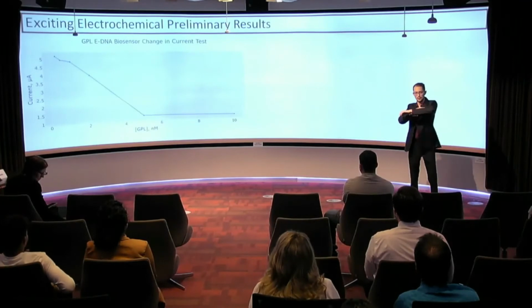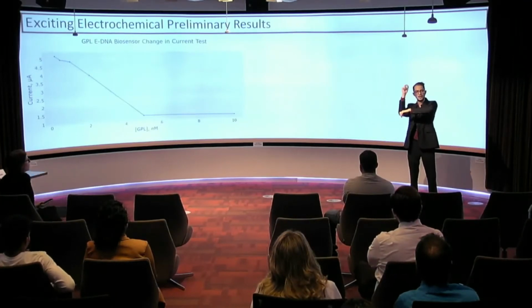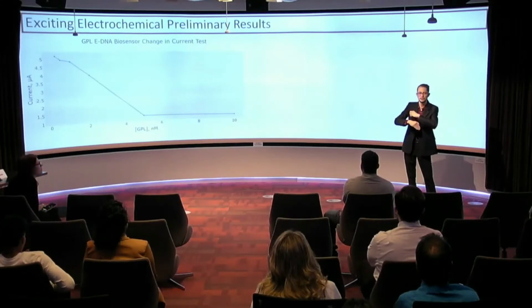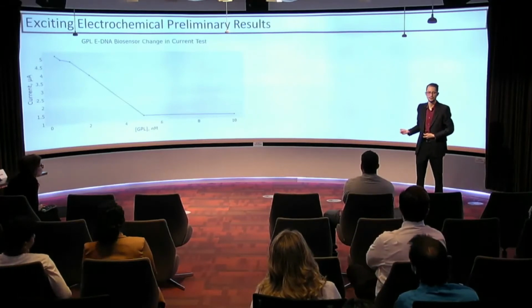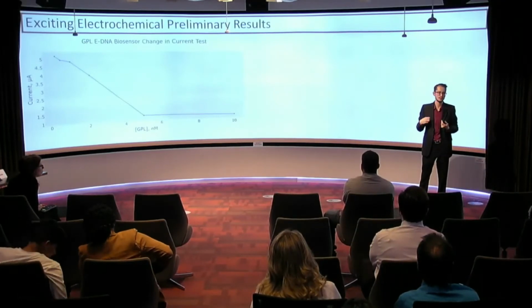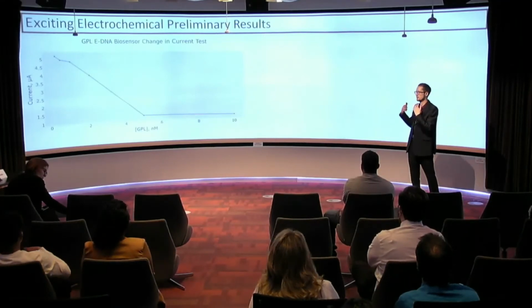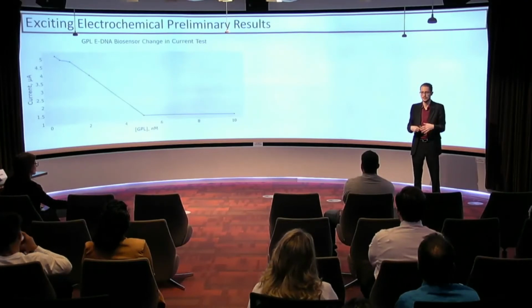So if my arm is that gold electrode and my finger is the methylene blue, it seems to be moving away from that electrode right now, causing that electrochemical current to decrease. But if we change the frequency of the square wave voltammetry, then we can actually create a signal on the biosensor in theory, so we're not too worried. We're just looking for some type of change. But we wanted to make sure it's not just non-specifically binding to any molecule.